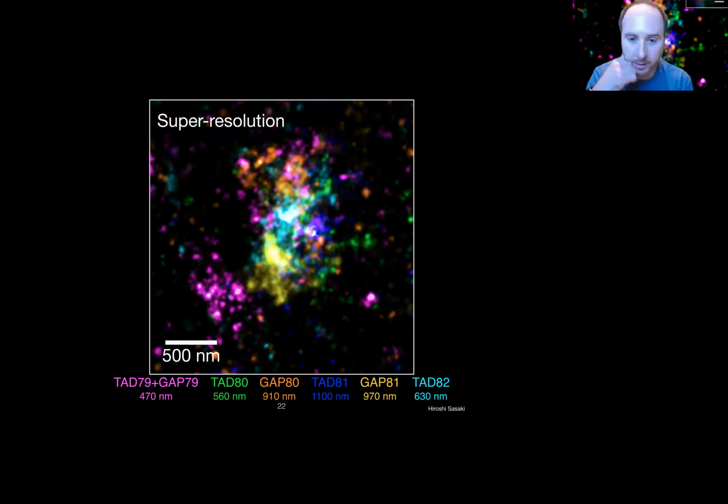And I think what's so striking to me, and we've also seen this now in work that's come out of Ting's lab more recently, and work from Zhao's lab and from Alistair Becker's lab at Stanford, when you look at these multiplex STORM or DNA paint images, the way that the chromosomes just interdigitate, and you can see so much going on in terms of the signal nestling around different colors and then packaging together. It tells us that we have, I think, a technology that is still pretty nascent, but might really be aimed well at trying to ask pretty nuanced questions about how different genomic regions are intermingling and associating on these very fine length scales.